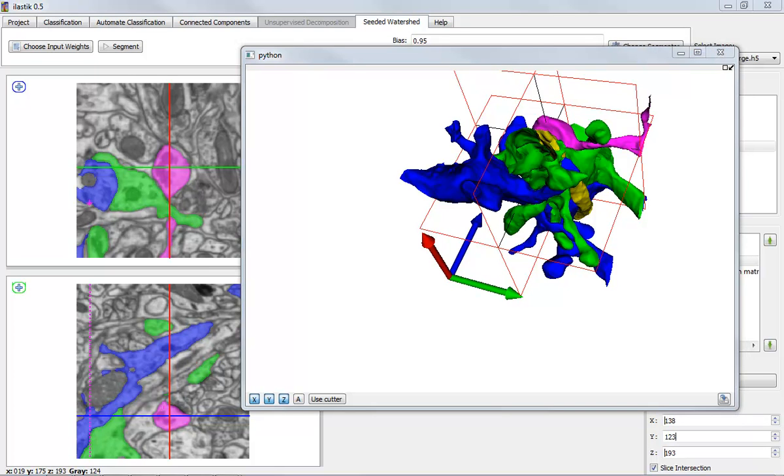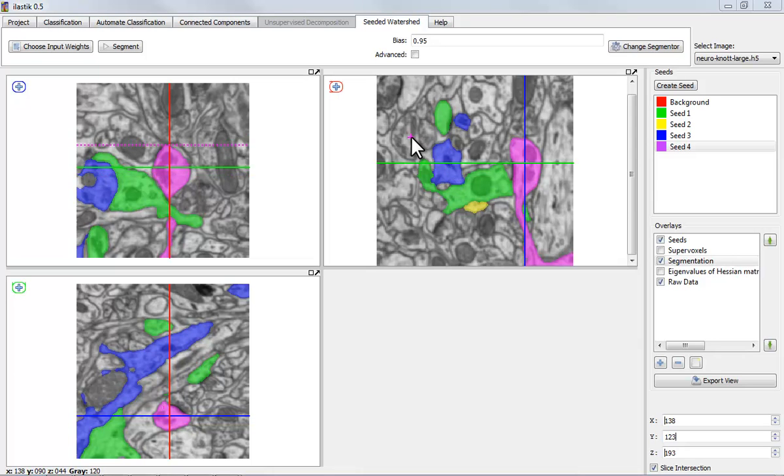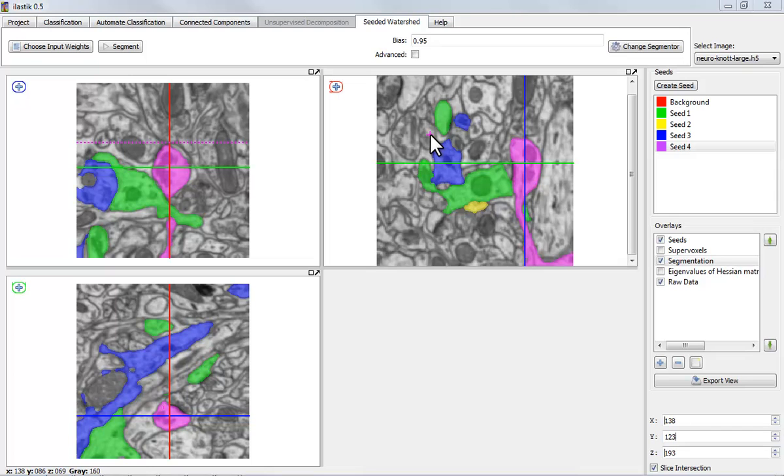So, this video showed how to use carving on 3D data. Carving is applicable when the structures of interest are not discernible by a machine learning method by itself. So, here if you look at these different neurons, they have the same appearance. So, a classifier would not be able to tell them apart directly. And this is why we here use the seeds, one seed per object, to get out the structure of interest. Now, the disadvantage is that when you move to the next volume, you need to do this by hand again. The advantage is that you can very quickly produce 3D renderings or get some insight into the 3D structure that you have acquired. So, thanks for listening.